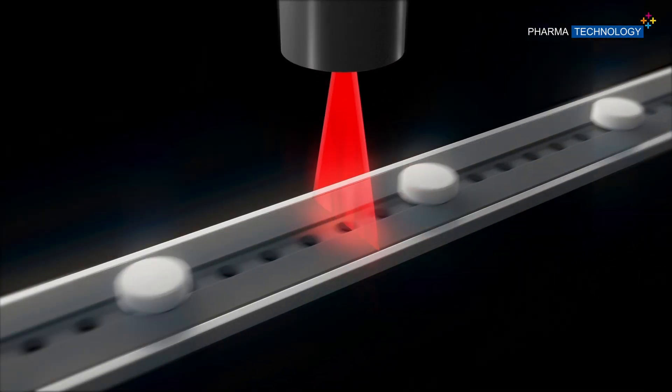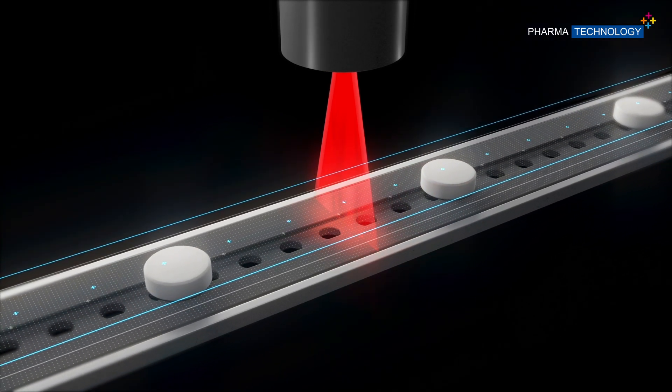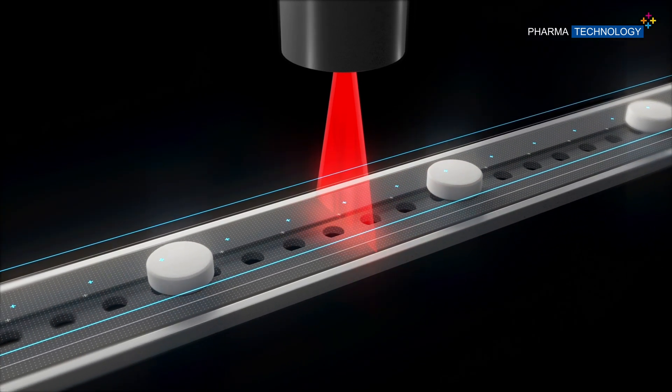Along the conveyor, a 3D laser scanner measures in real time, for each single object, the thickness — in the case of tablets — or the length — in the case of capsules — with an accuracy down to 0.1 mm.